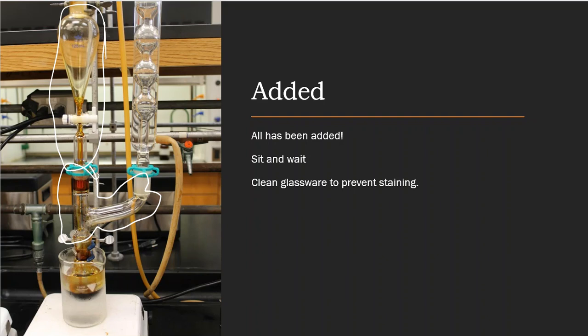One of the reasons is it stains. The iodine will stain this glassware if I just leave it sitting in there, and it's something that I don't want to happen. I pay a lot of money for the glassware. I don't want to ruin it. So I'm going to take these off. I'm going to rinse them with acetone.